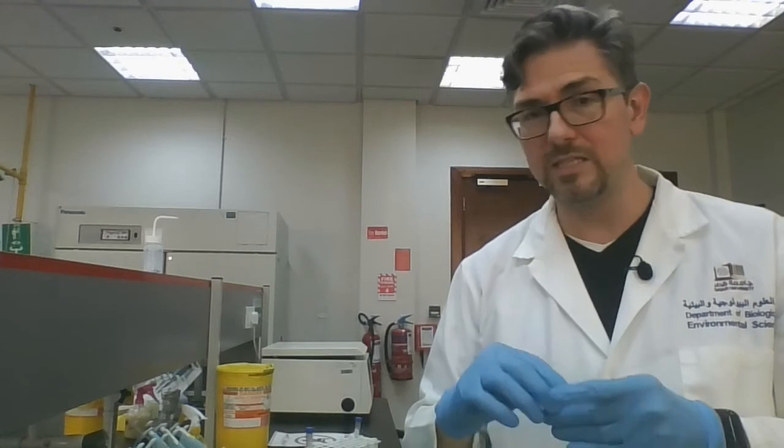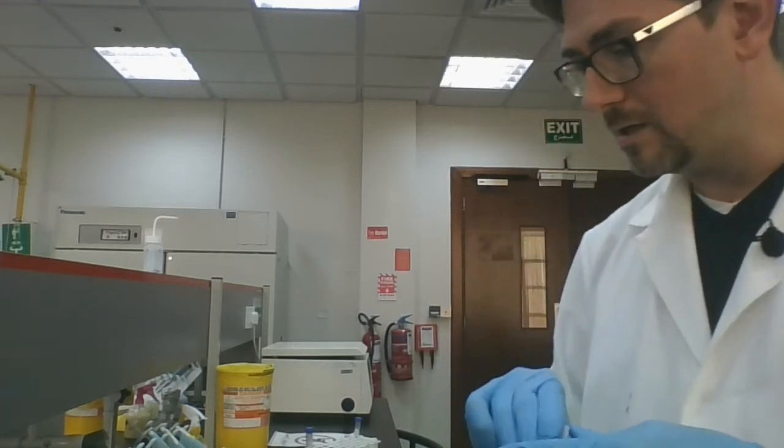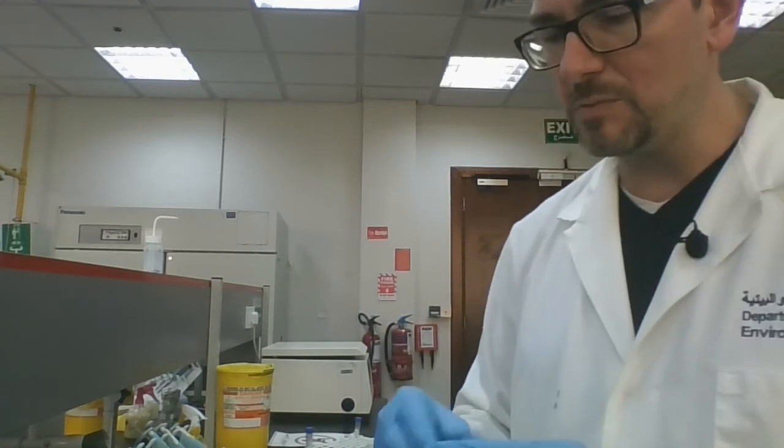We're going to just spin it down for about 1 minute. Okay, and we're going to do it at maximum speed. So I'm going to put it in the centrifuge again, make sure that they are balanced, and run it for 1 minute.